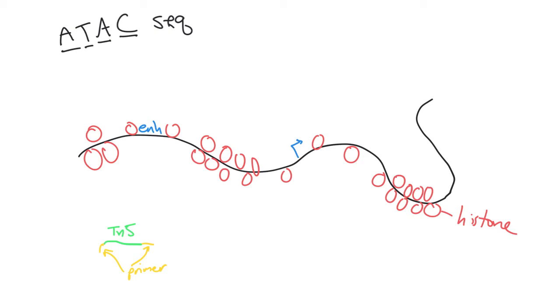And that transposon is then activated. And what the transposon does is, again, it's a jumping gene. It actively inserts itself into DNA. And the concept here is that it can't insert itself into heterochromatin because the DNA is too compacted and tightly associated with proteins, the histones, but it can insert itself into euchromatin.